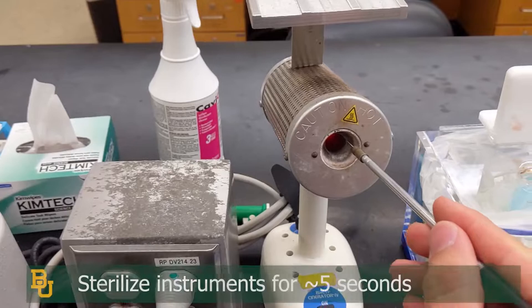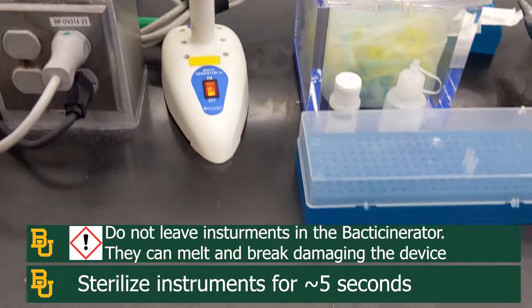To sterilize equipment, you will use a loop or a needle, and you will gently insert it in there and hold it for about five seconds. Please do not rest things on the inside, as it can break the metal and destroy it.